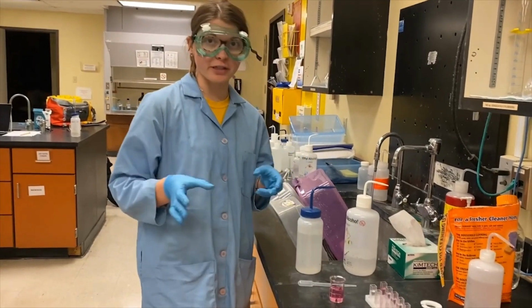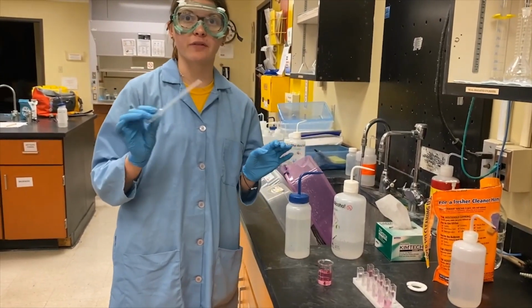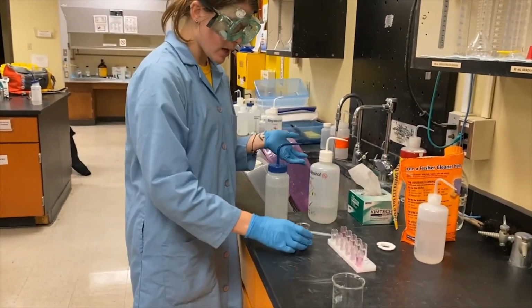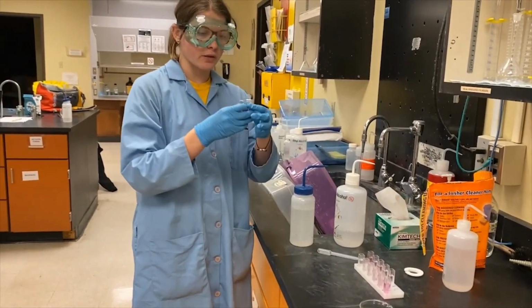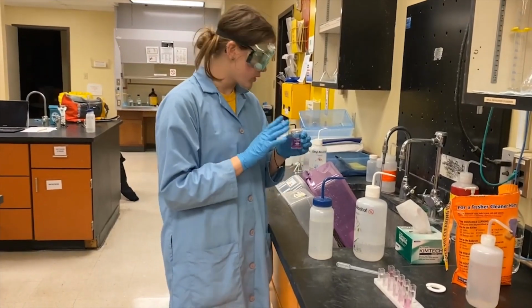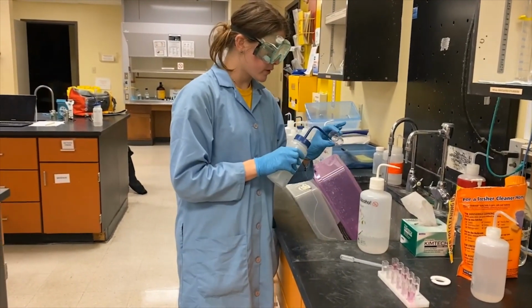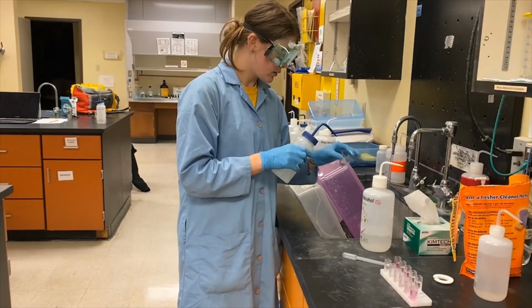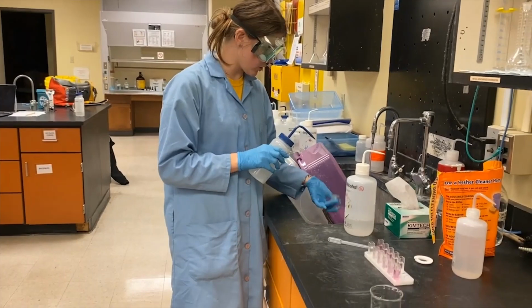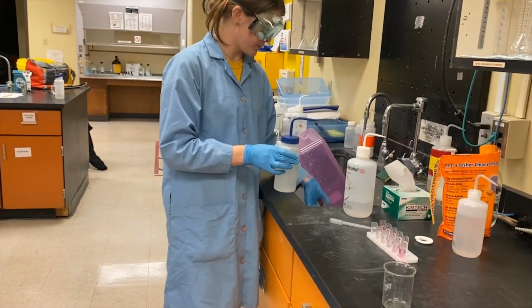Okay, so for our cleanup today, it's relatively simple. All pipettes can go in the trash. They don't have to go in the solid hazardous waste because we don't have hazardous waste today. Our solutions, like you saw, are just chlorine. There's already chlorine in the water supply, so we can dump these down the sink, no problem. We're going to go ahead and rinse with DI water. Two or three times is usually a good estimate to get everything out.